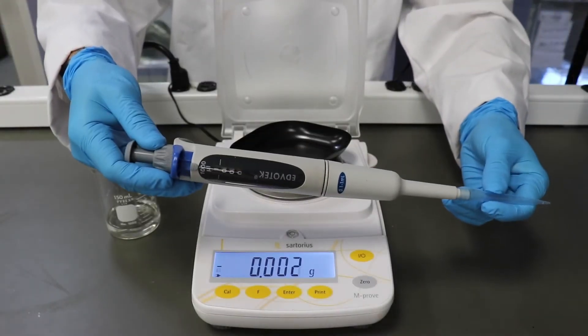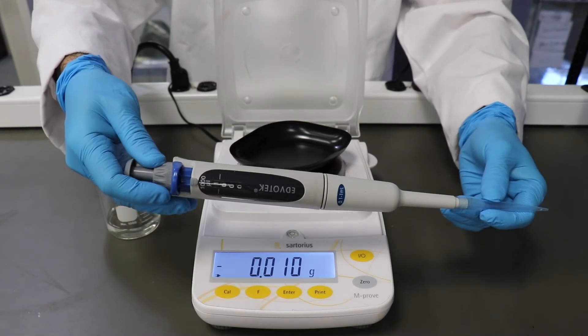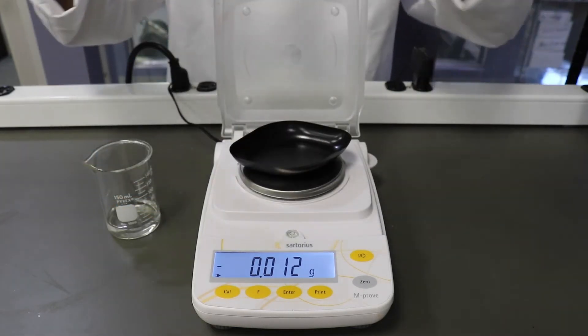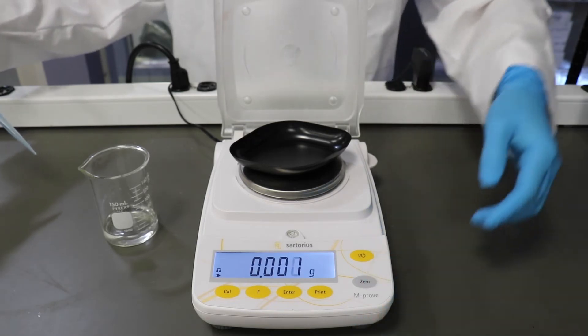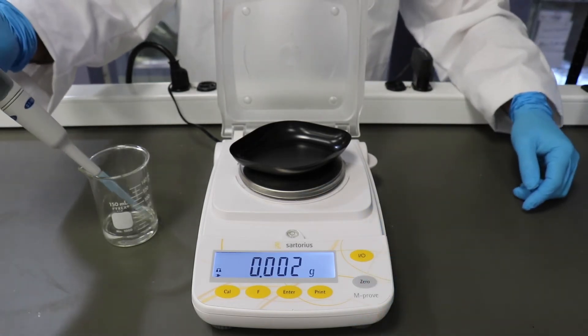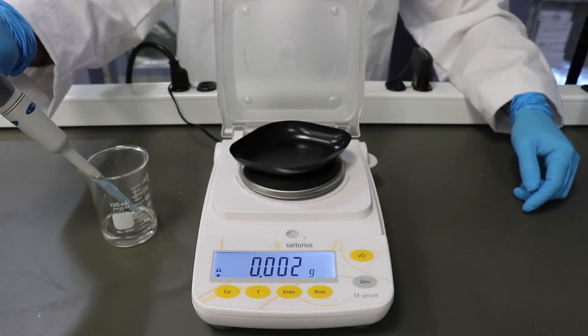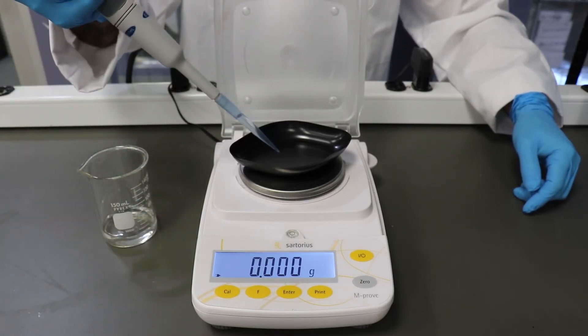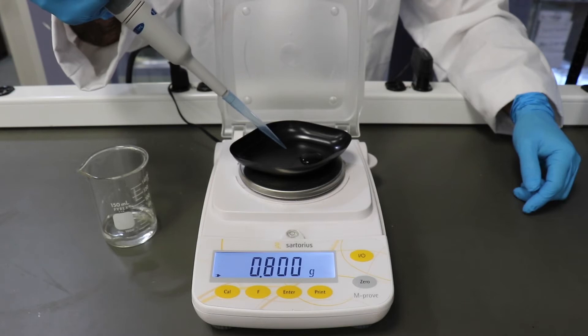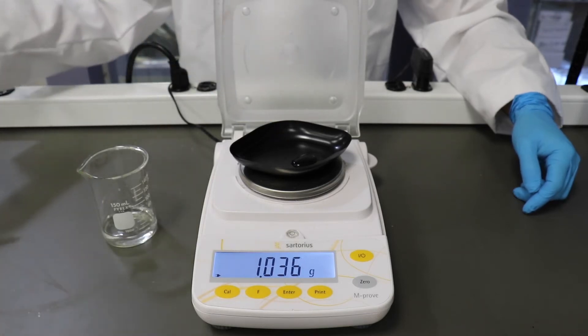Set the micropipet to its maximum value. Remember, one milliliter of water is equal to one gram. Dispense the known value of water into a tared weigh boat on the balance. If the mass of the liquid is higher or lower than the volume set on the pipet, then your pipet needs some adjusting.